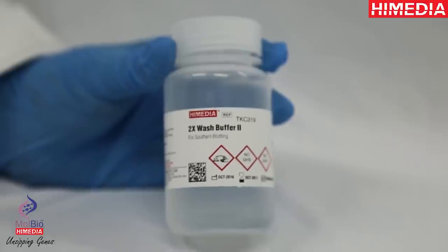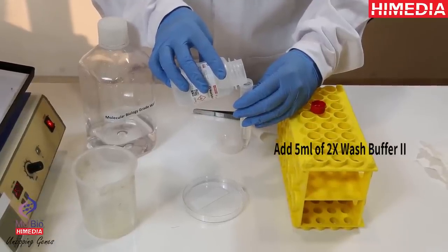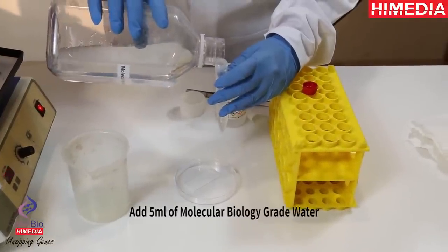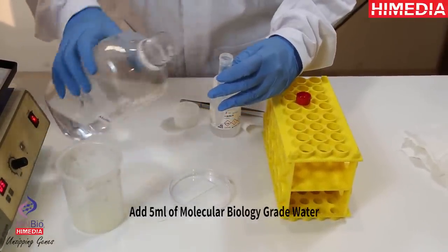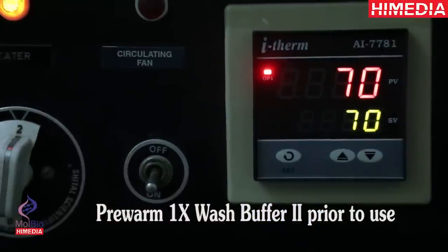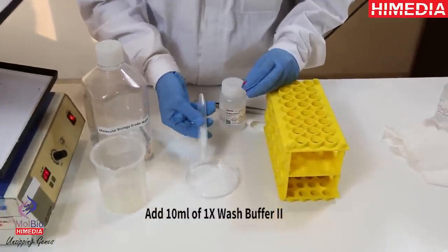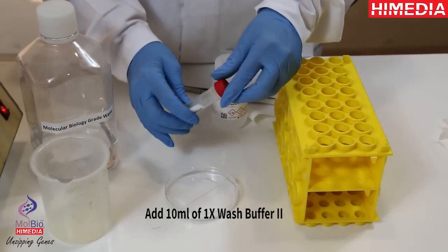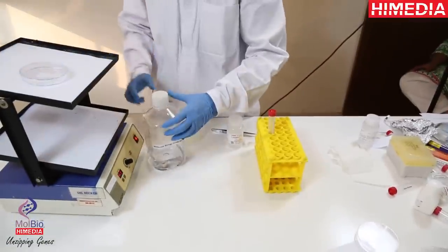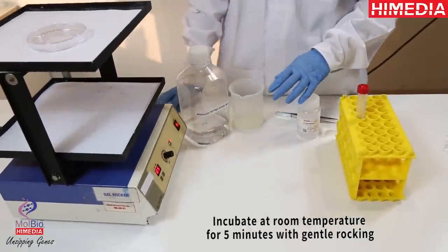2X wash buffer 2. Add 5 ml of 2X wash buffer 2. Add 5 ml of molecular biology grade water. Pre-warm 1X wash buffer 2 prior to use. Add 10 ml of 1X wash buffer 2. Incubate at room temperature for 5 minutes with gentle rocking.